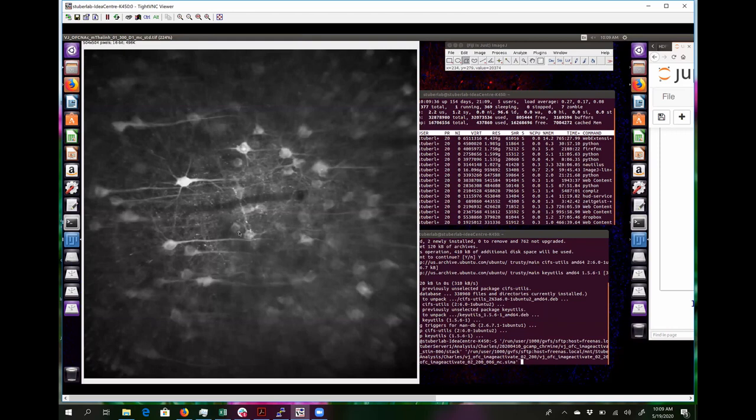Yeah. So sometimes you'll see a couple of cells that you think are in the field of view, but you won't know if you're off by a little bit. The blood vessels too, you won't necessarily know if you're off by a little bit, but at least you know if you're pretty much in the correct area. And then you might need to adjust within like 10 microns or something. I see. So this will get you close to like 10 microns.